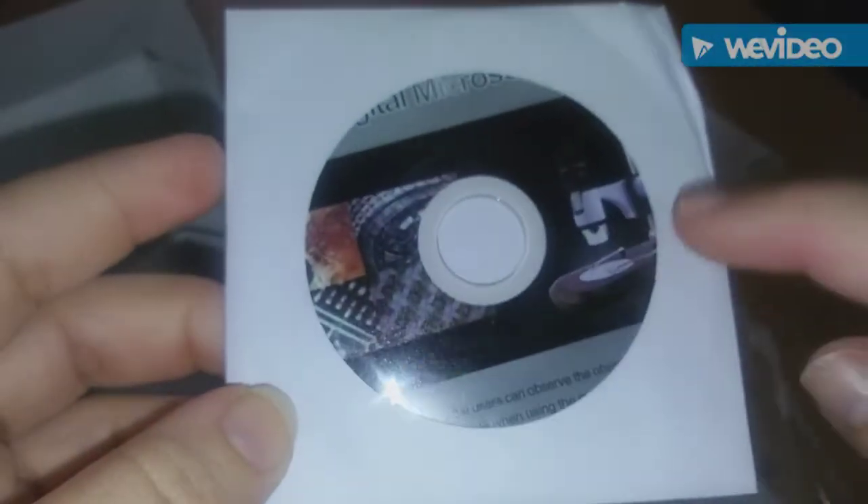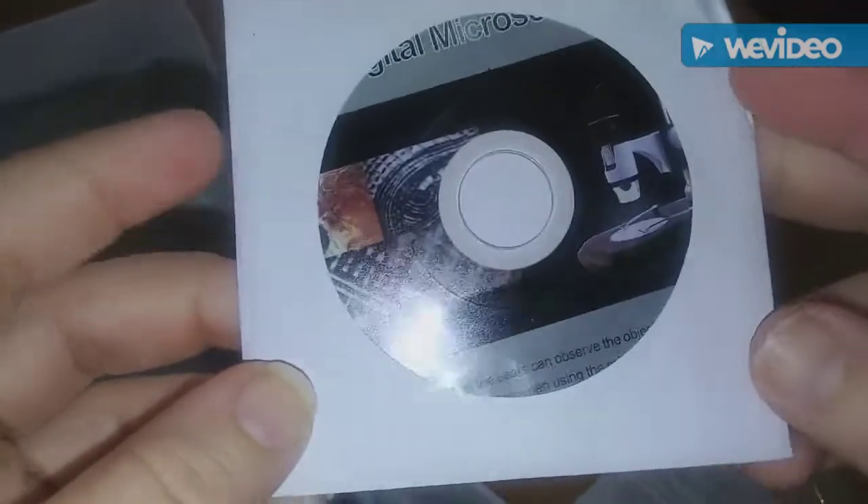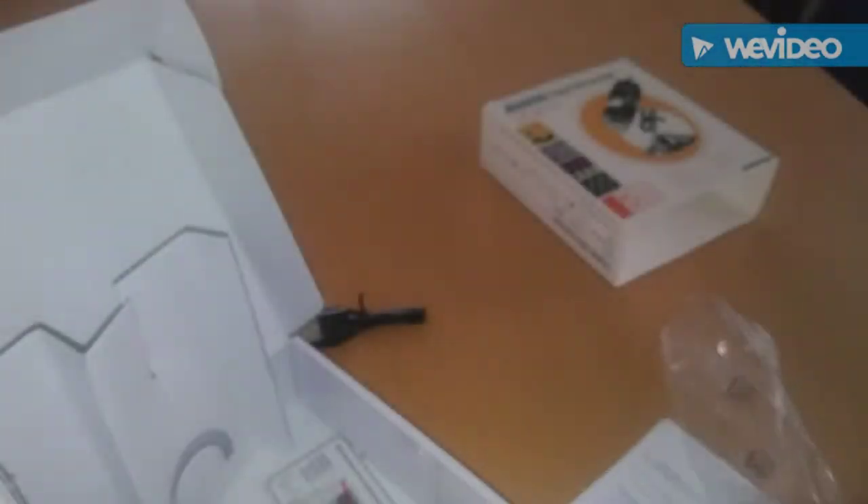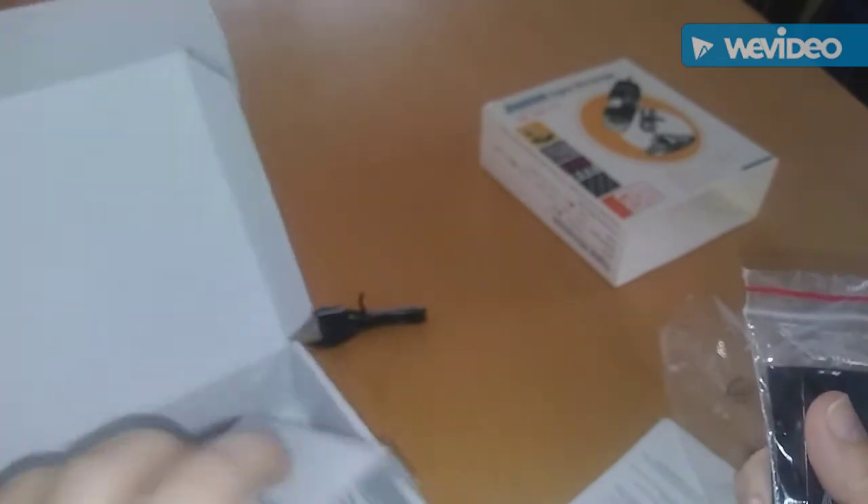You also get a CD in case you want to use this on your laptop or computer. You can install it that way, but I like to use it through my phone — it's more simple and faster.